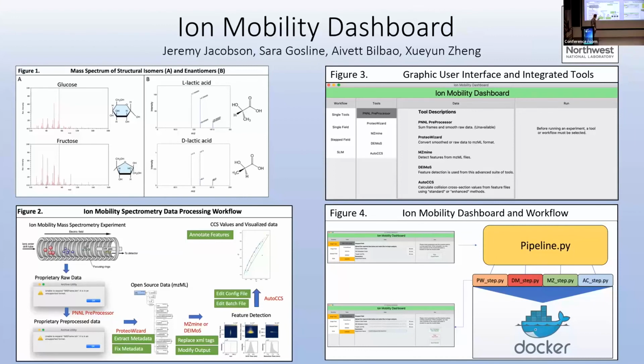In the green, each of these green tabs are intermediate scripts or steps that are required as well. Just running all these tools with these intermediate scripts makes it difficult to process this data. And so this is what we're trying to solve in this application.